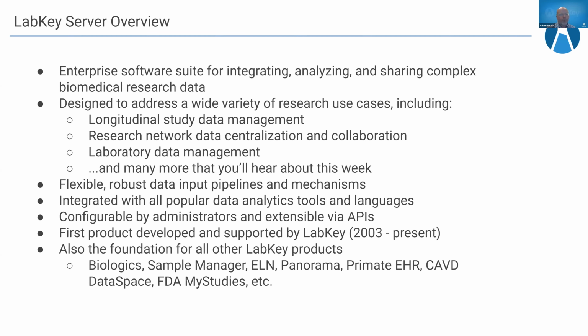As Michael said, we have 500 organizations using LabKey, and they all use it in a different way. So many different scenarios, many different use cases. But some of the sweet spots for LabKey include longitudinal study data management. So think clinical trials, observational studies, patient-reported outcomes over a period of time. Any kind of time-based data collection, LabKey is very good at. Oftentimes, this data collection occurs within the context of a research network. So oftentimes countrywide or even, in many cases, global collaboration, collecting data from many different partners, securing and sharing data in many different, complex ways. LabKey, again, does a very good job of handling those types of collaborations.